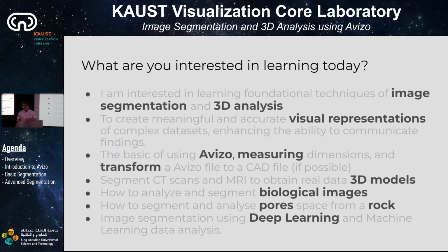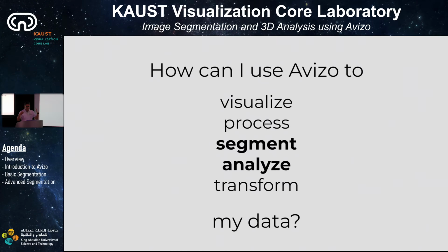All right, so throughout the workshop, I want you to keep this question in mind. And hopefully by the end of the workshop, you have some sort of answer. And that is, how can you use Avizo to visualize, process, segment, analyze, or transform your data? We'll focus on segmenting and analyzing, but there are other things you can do with Avizo. It's super powerful. So keep that in mind. If you don't know the details by the end, that's fine. You can always approach us in the Viz Lab to help you.